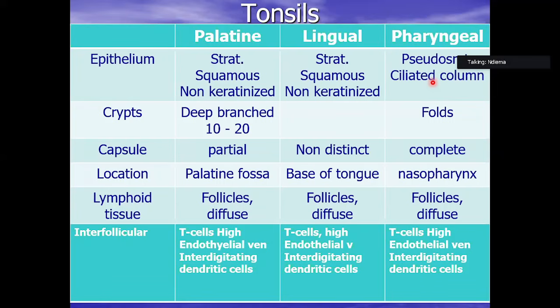What will be the characteristics of the tonsils? One, it's associated with epithelia. In the case of the palatine and the lingual tonsil, we have stratified squamous epithelia.